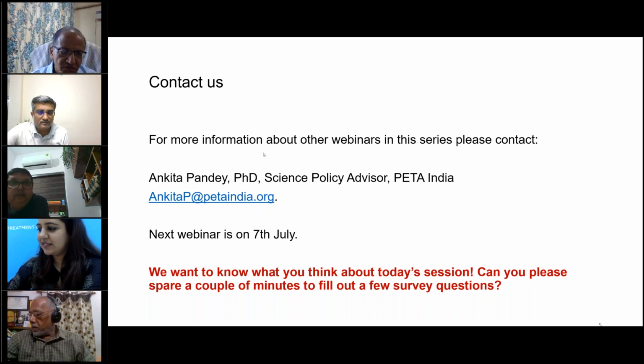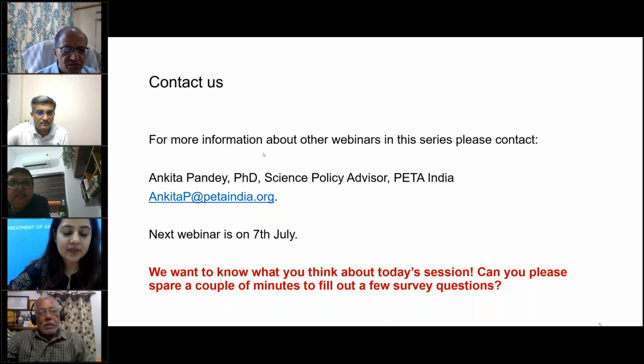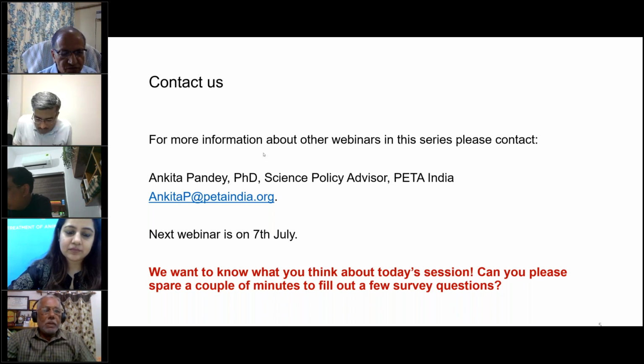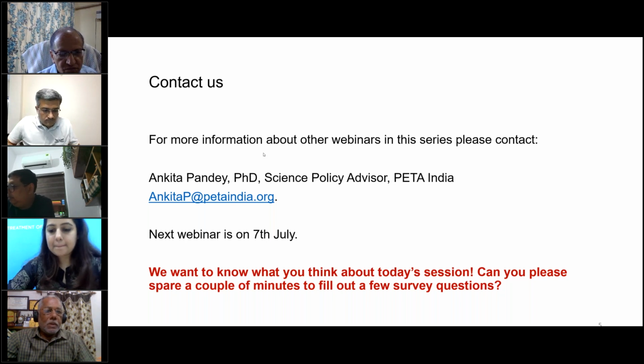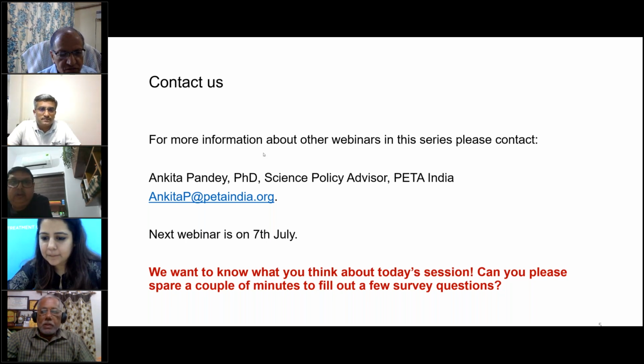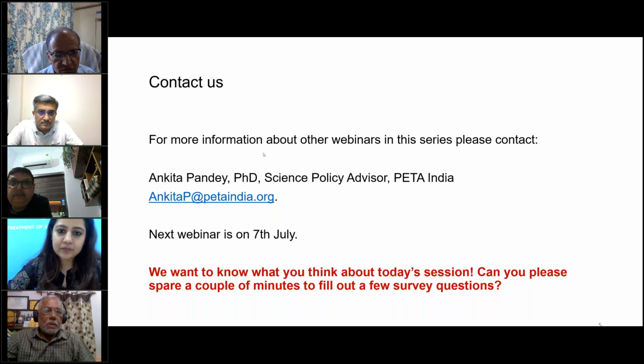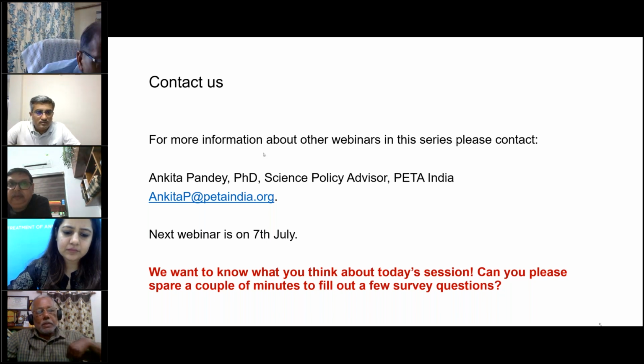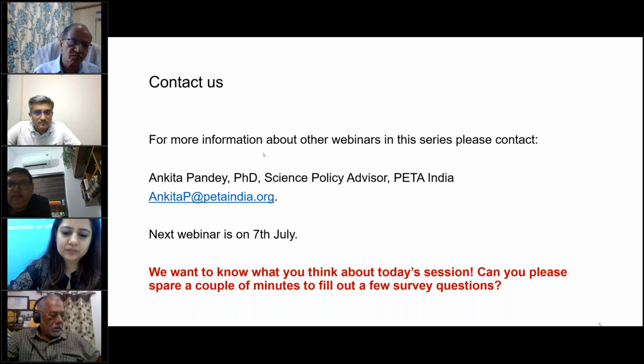Concluding the session anyway. A lovely presentation as usual by the presenters, and I have just got 2 sets of questions. One is directly to Dr. Parvati. Dr. Parvati, I noticed that you said that the bovine corneas, bovine eyes, are taken from slaughterhouses. I would like to know whether there's any specific procedure to this part, and when and how do you acclimatize those isolated parts as an alternate method? Just curious on that part.